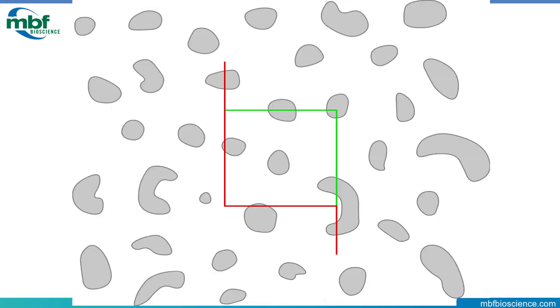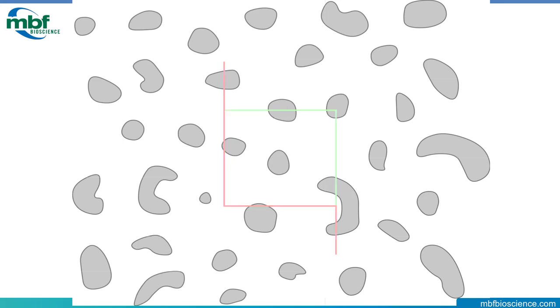The way that unique point gives each cell an equal chance to be counted once and only once is as follows: we'll mark the unique point of a cell if that unique point falls inside the counting frame or touches the green line. If the unique point touches the red line or falls outside the counting frame, we won't mark that cell. This is useful because if we had another counting frame directly adjacent to this one, those unmarked cells would be marked in that adjacent site.